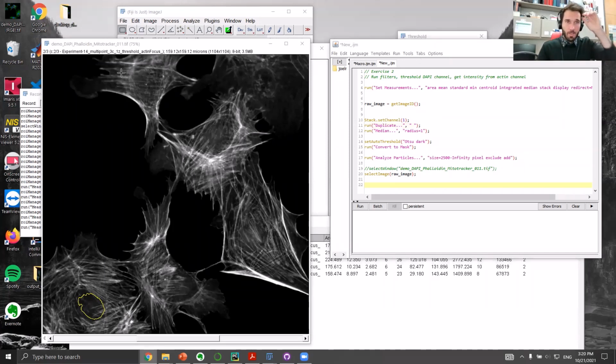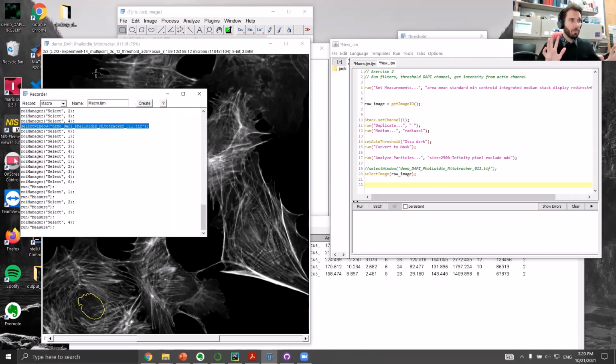All right, and so does this make sense to people? Is there something wildly confusing? I got a couple of thumbs up. This is good. Thank you, thumbs up, people. So this is handy. It allows us to switch. So it allows us to do some of these mouse things. It's one of those commands that won't easily appear.